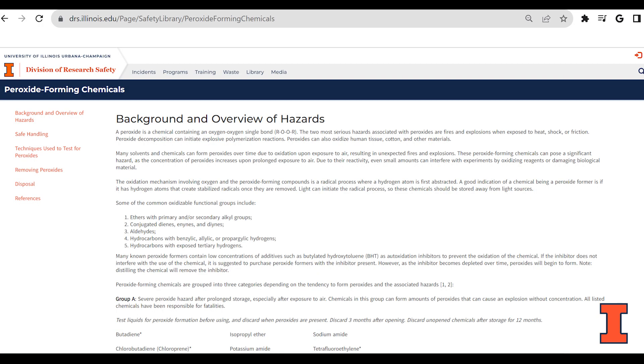Some peroxide forming chemicals require more frequent testing. Refer to the DRS library page for more information on common peroxide formers.